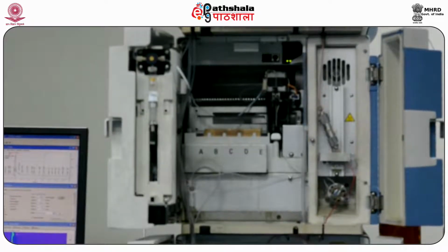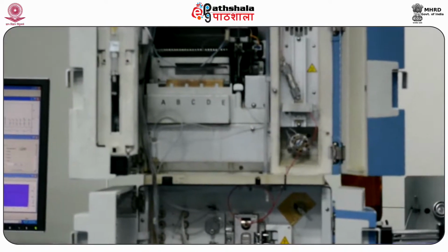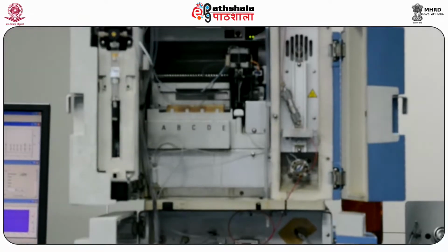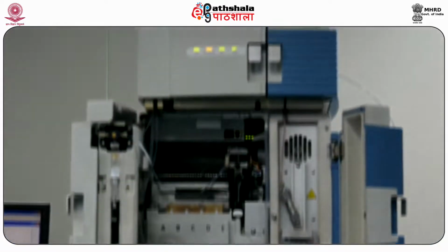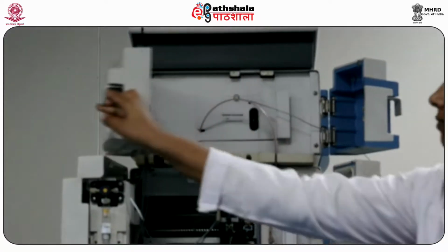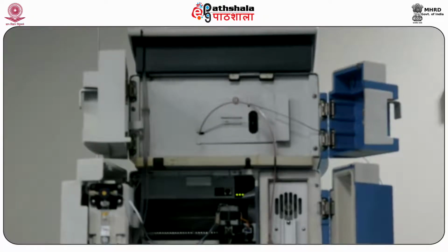The column you see here is a small one, and the whole compartment is thermojacketed, so you can keep the temperature constant. It enables us to work at higher temperatures, where the temperature must be set at higher digits; about 40 or 45 degrees centigrade is possible. After leaving the column, it reaches the detector. Here the detector is a photodiode array detector, continuously monitoring all the available nanometers, from 190 nanometers to 700 nanometers.